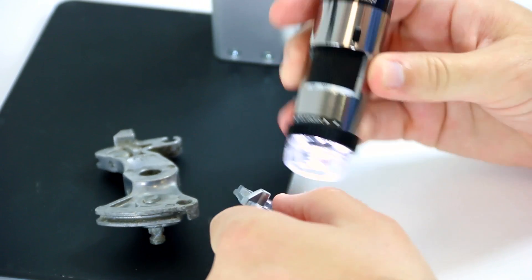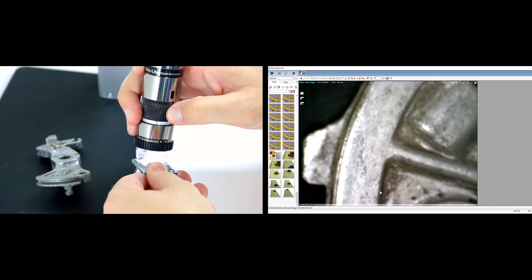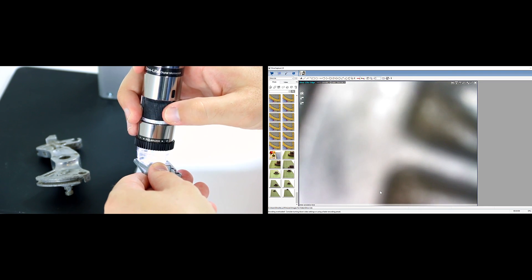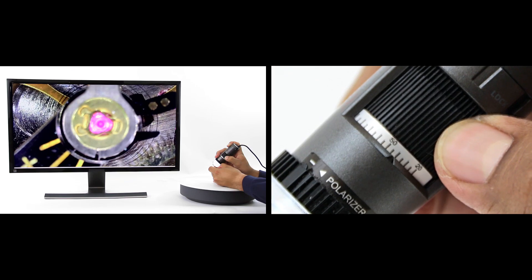With a standard Dynolite model, when the end of the nozzle is touching the viewing subject, the scope will focus at 50 times and once again at 220 times magnification.